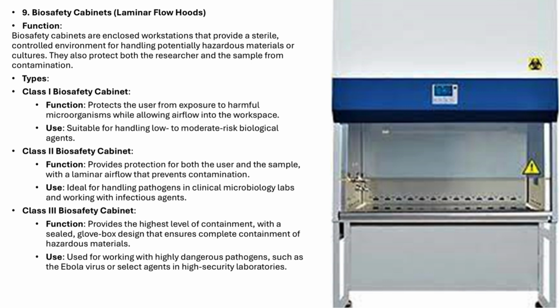Class 1 Biosafety Cabinet. The Class 1 Biosafety Cabinet is designed to protect the user from harmful microorganisms. It allows airflow into the workspace to prevent exposure, but it doesn't offer protection for the sample itself. This type is suitable for handling low to moderate risk biological agents, like certain bacterial cultures.